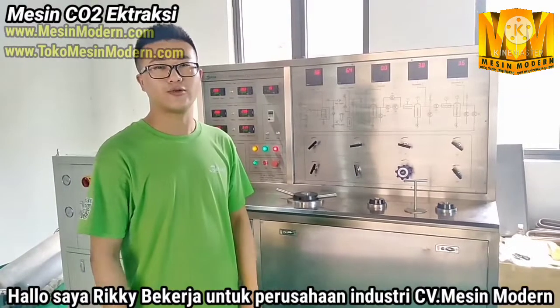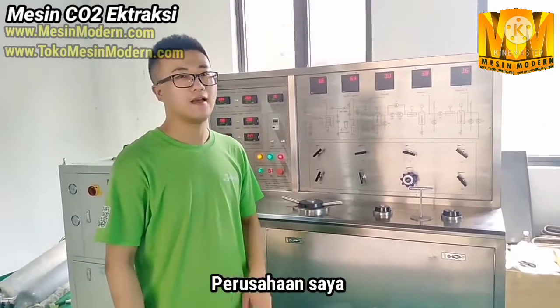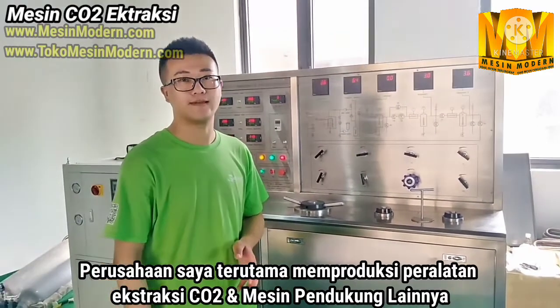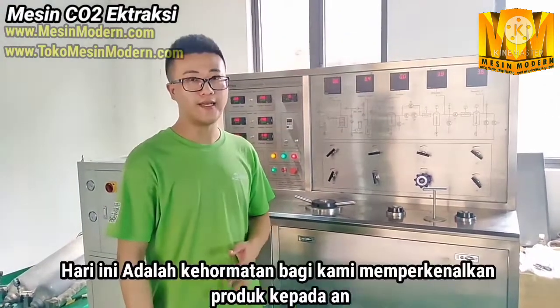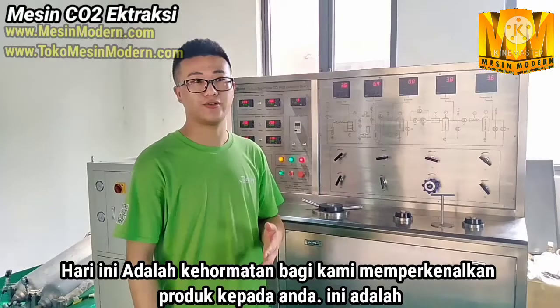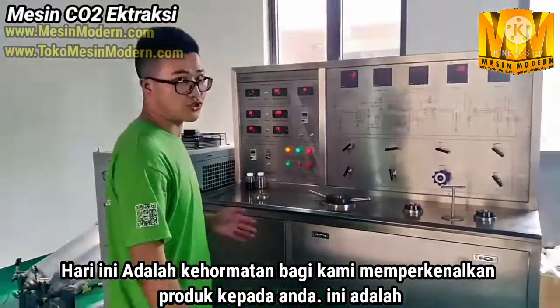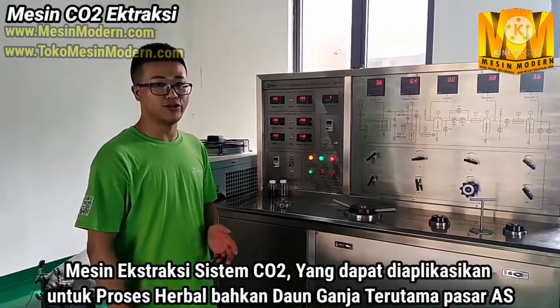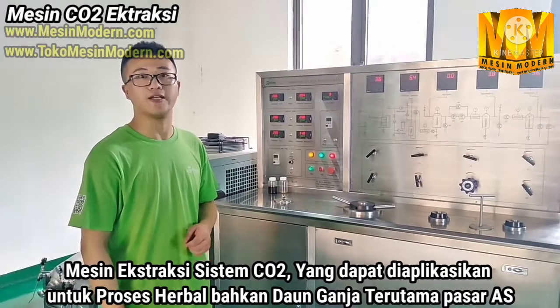Hello, this is Rich Liu. I work for Shanghai Biter Industry Company. My company mainly produces extraction equipment, also with some post-processing equipment. Today it's my honor to introduce one of our products to you. It's a CO2 extraction machine, mainly used to process hemp and cannabis, especially in the U.S. market.